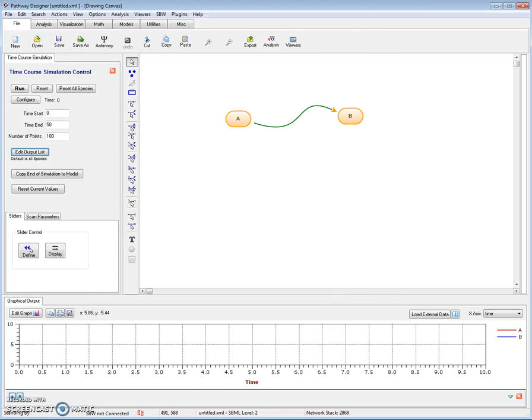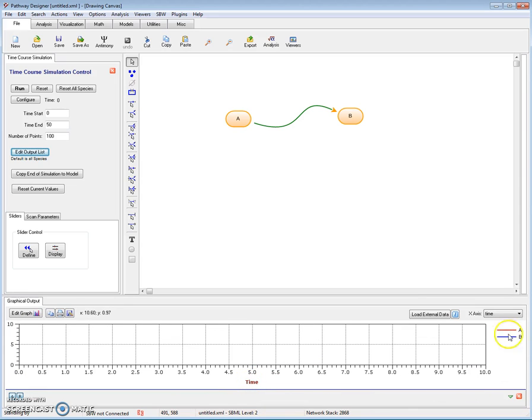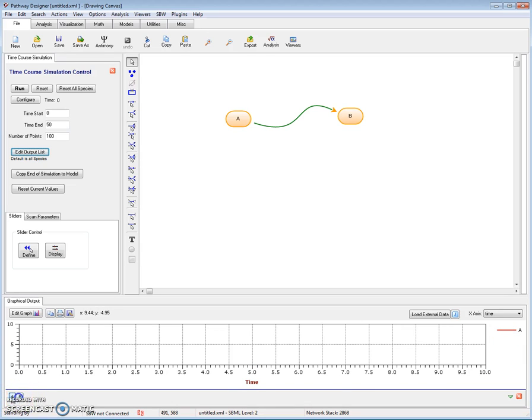If I click OK, the graph changes. You see now that the x-axis becomes time, and the legend changes to A and B, showing that A and B will be plotted. These two other buttons appear down here, A and B, and I can bring these in and out if I want to selectively plot these two at a later date.